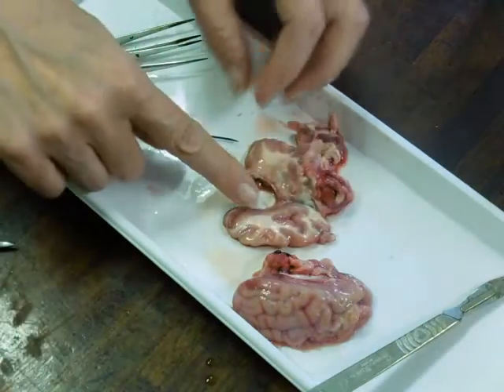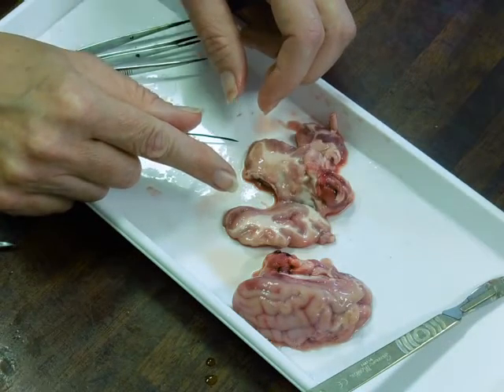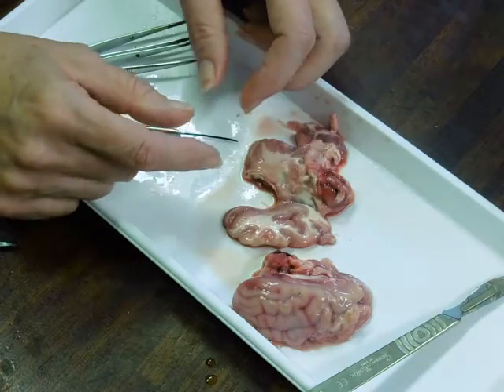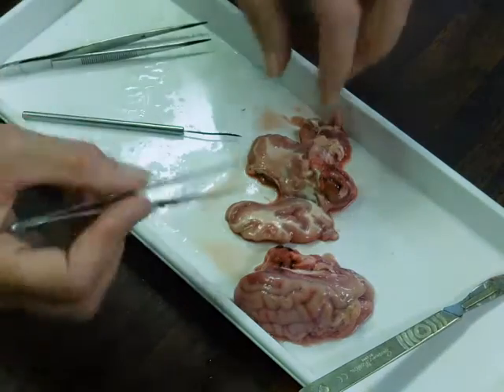So the white bit is white matter. Have you heard of that? Have you heard of grey matter? You've not heard of grey matter? I've heard of pink matter. Pink matter? It's a song. Oh, is it? Dark matter in physics. Dark matter in physics, it's not that.